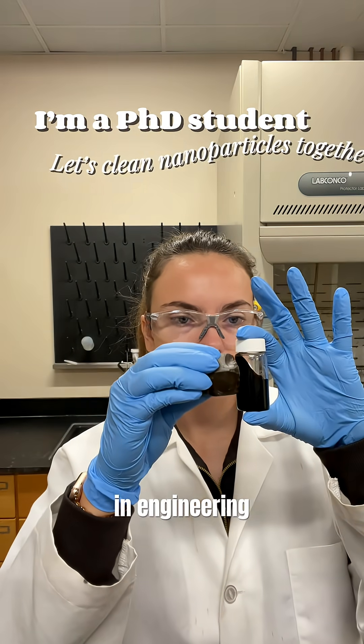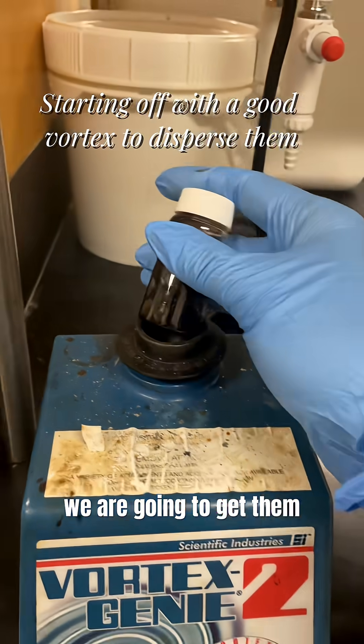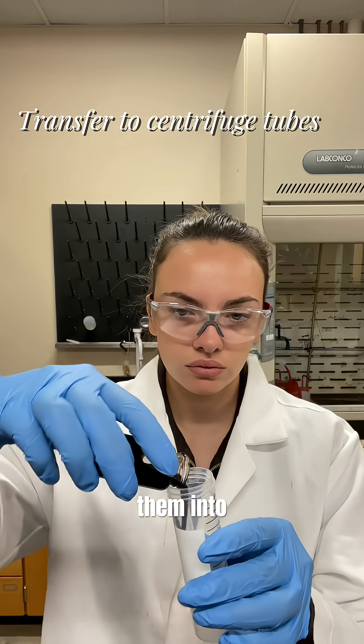I'm a PhD student in engineering. Let's clean some nanoparticles that I made. First off, we are going to get them nice and dispersed using our vortex and we're going to transfer them into centrifuge tubes.